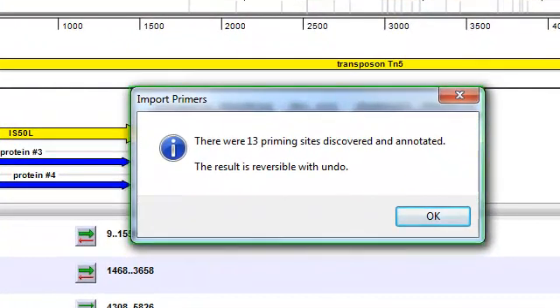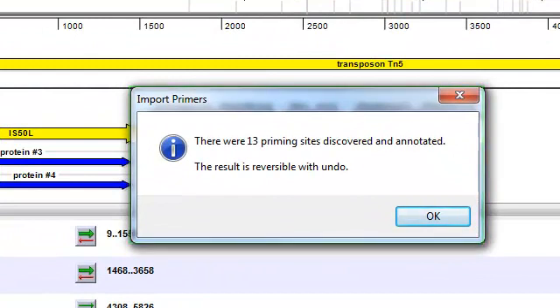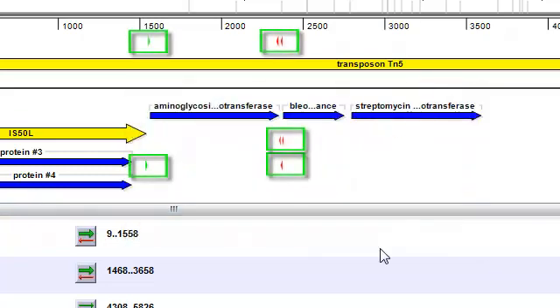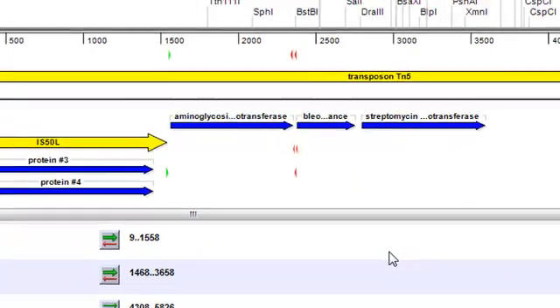So as you can see here, SeqBuilder found and annotated 13 primers from my catalog. And if I click OK, I can see the new annotations here on my linear map.